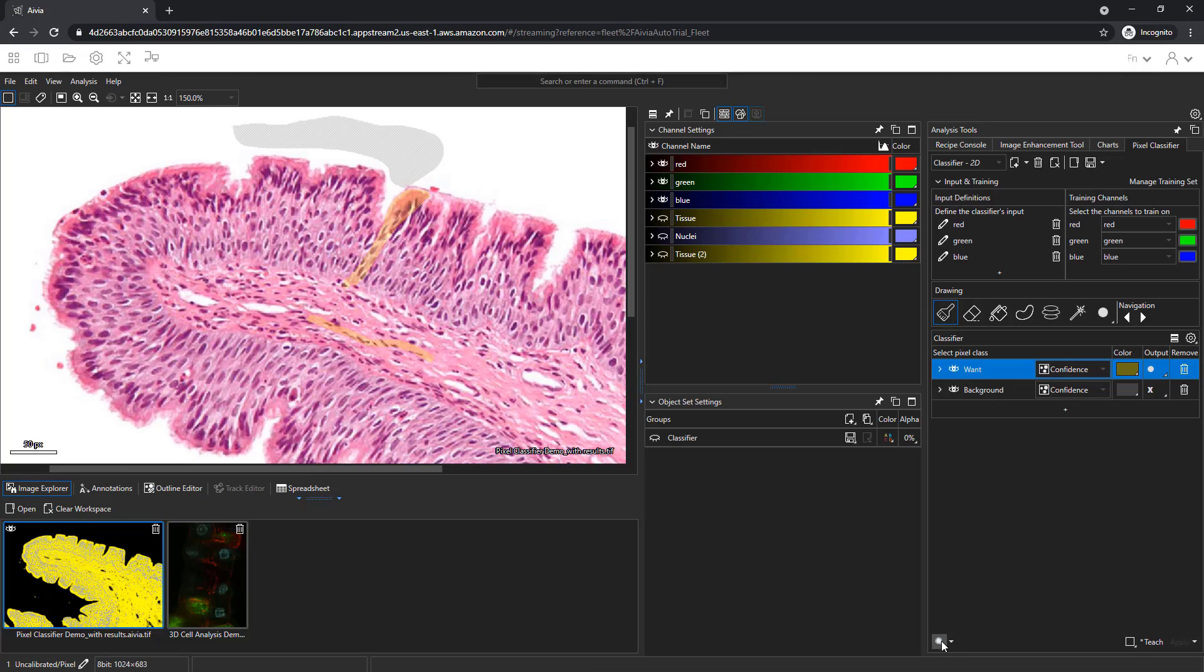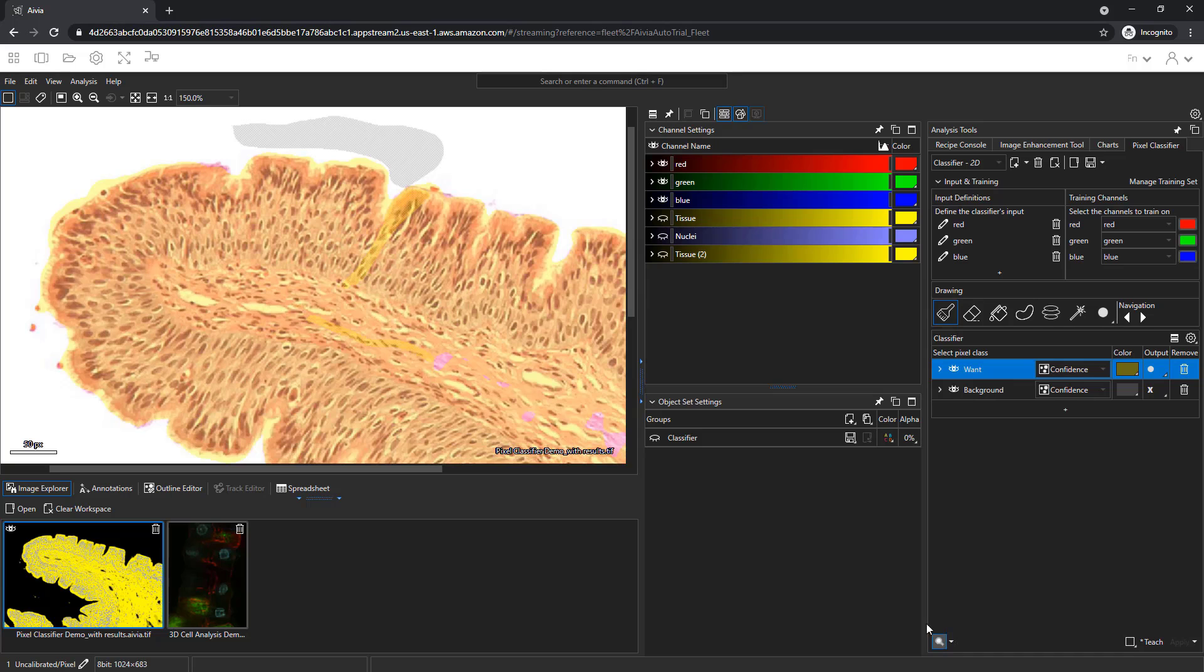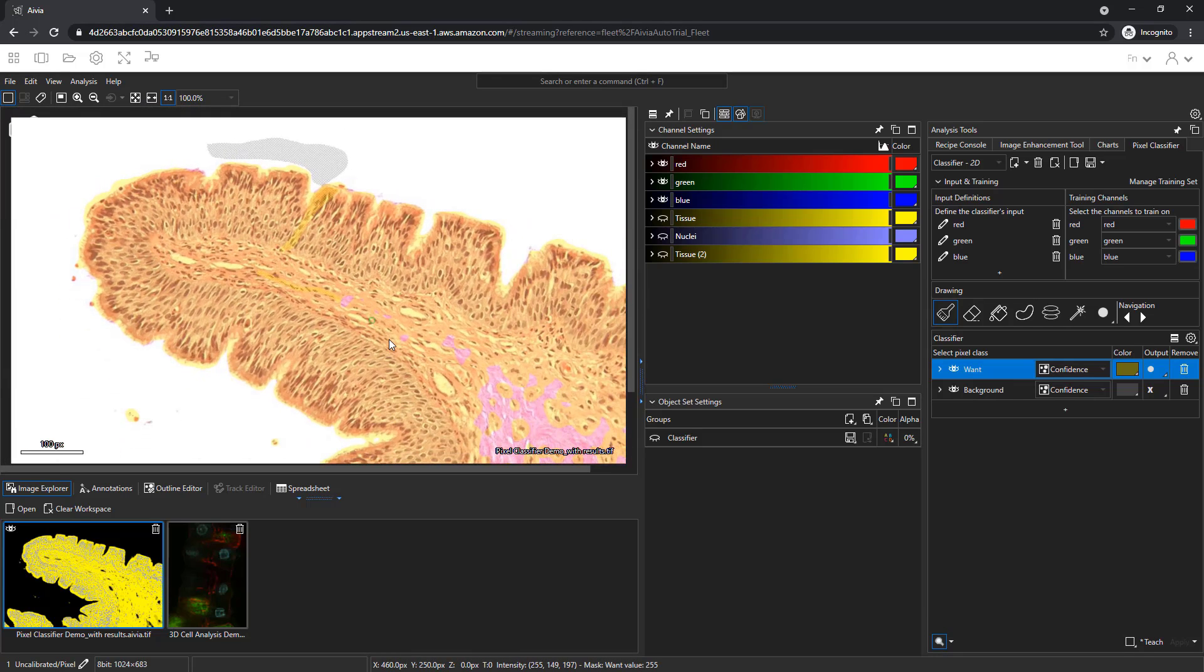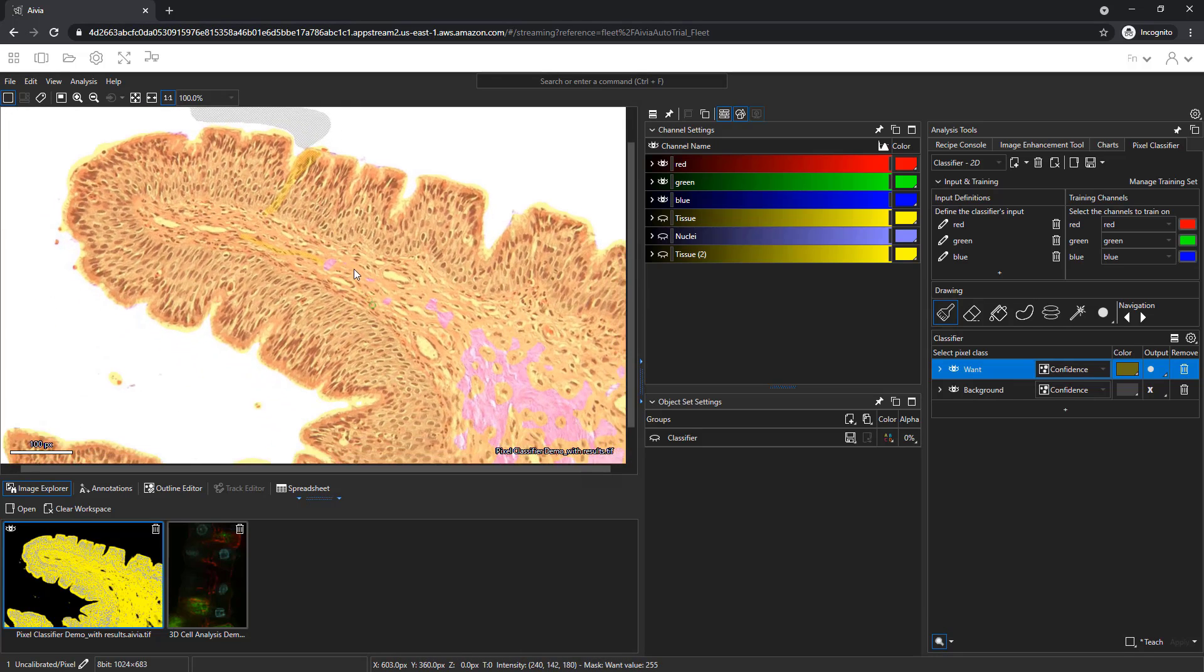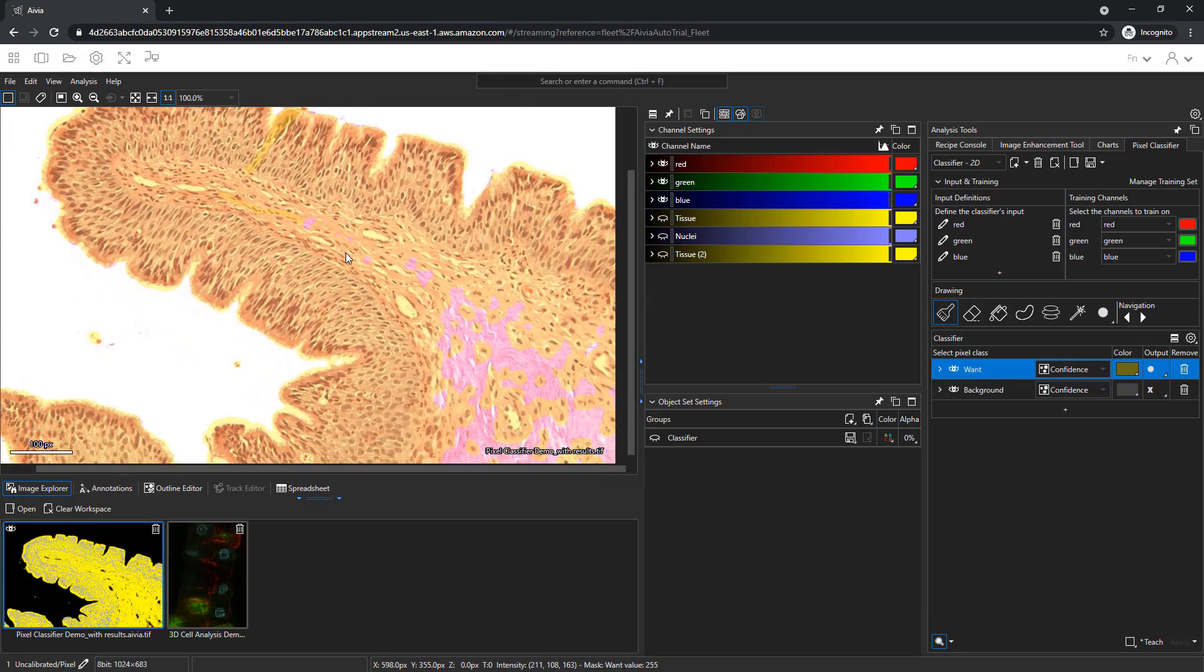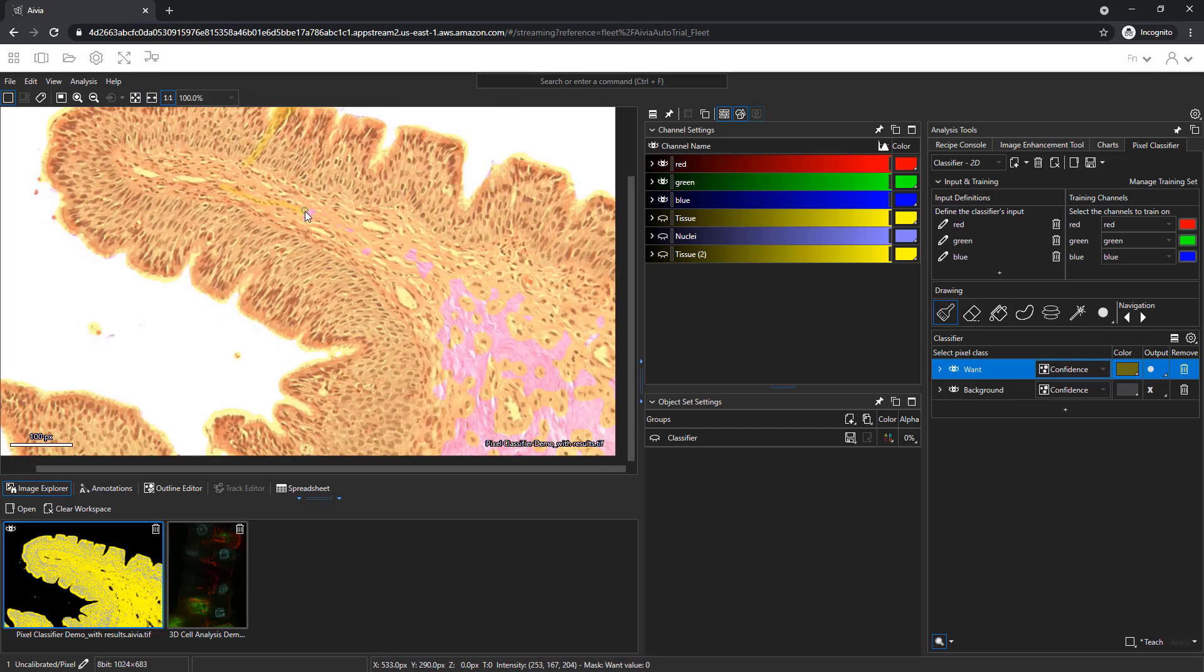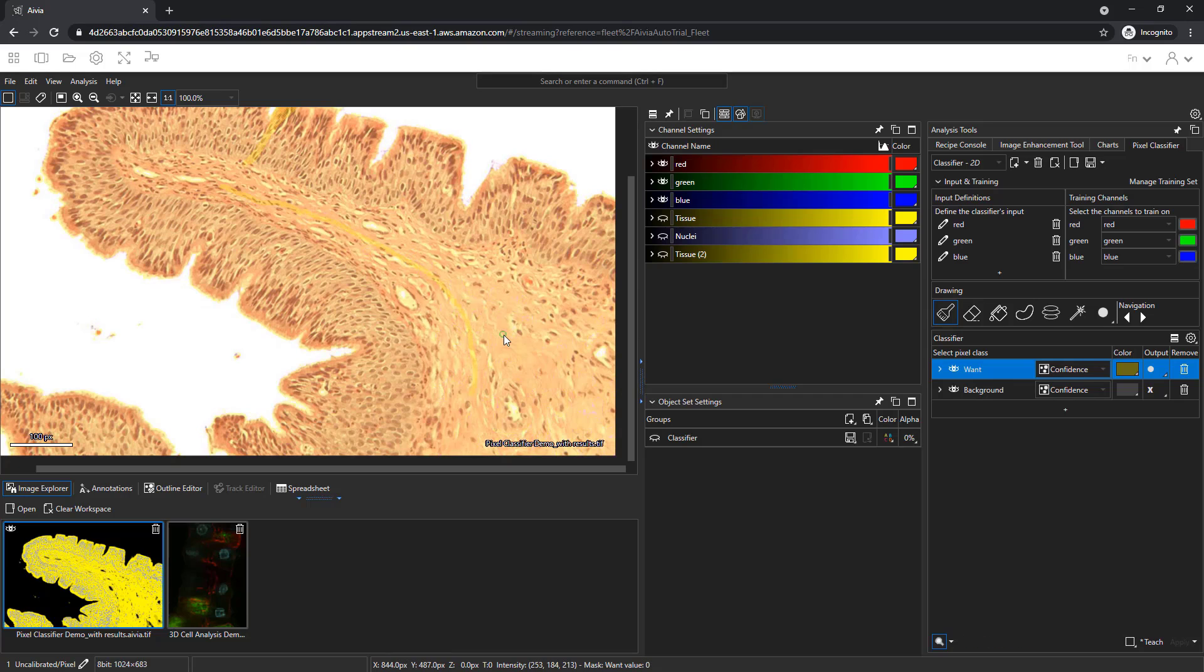Use the magnifying glass icon to preview the pixel classifier results. The result is overlaid on the image as yellow. There are some missing parts to the preview, so let's paint another region. The preview updates as you paint additional regions.